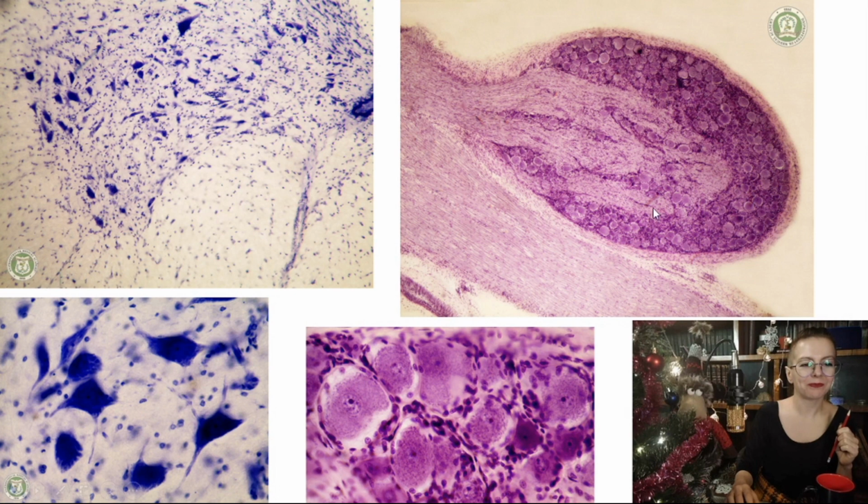Okay, then this is the spinal ganglion, and it is incorporated in the dorsal root. Here is the ventral root, and here is the spinal nerve. And if we magnify, pseudo-unipolar neurons, here they are, and do not forget they are concentrated in the spinal ganglion.